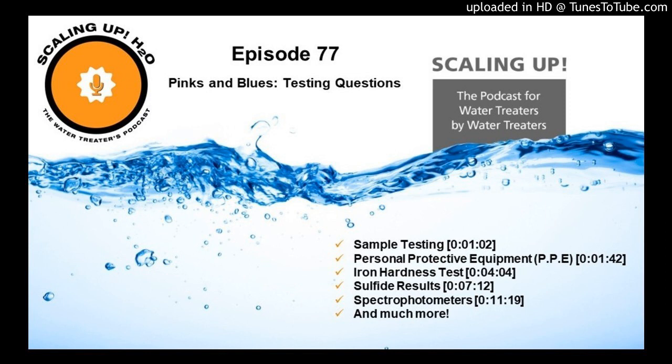It's a starch test, and you put iodine on it, and that's what creates that black color. Well, the starch comes from potatoes. So essentially what you're doing is cooking the potatoes, and there's not enough starch in there to react with the iodine, and you're thinking you have more sulfite in your sample than you actually do. Very simple, easy way for you to fix this problem, and it's to cool your sample.